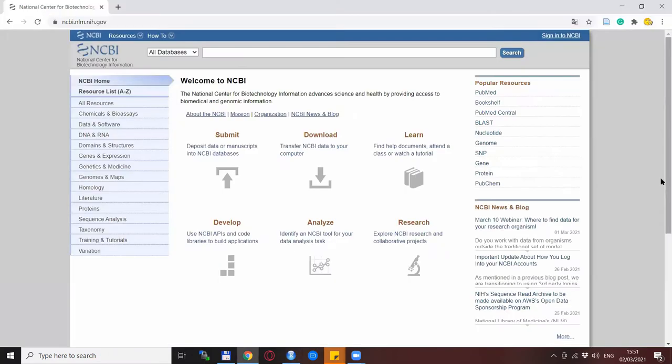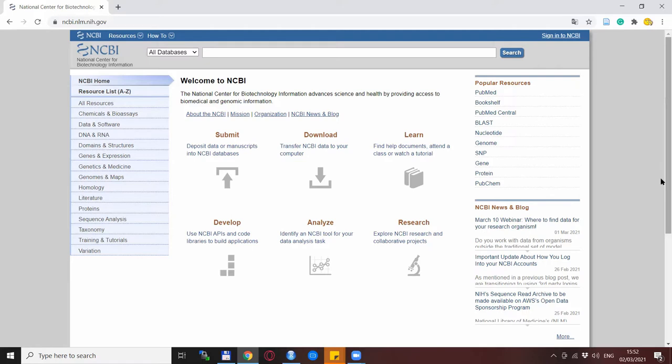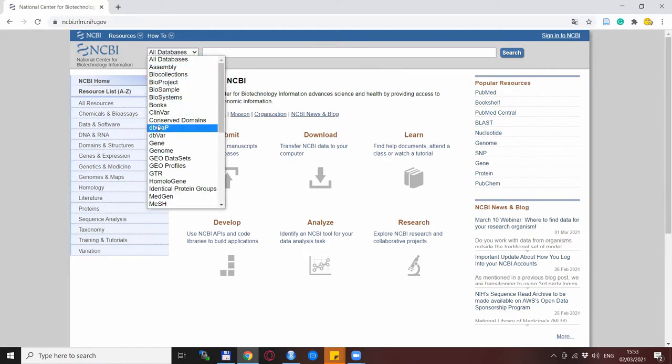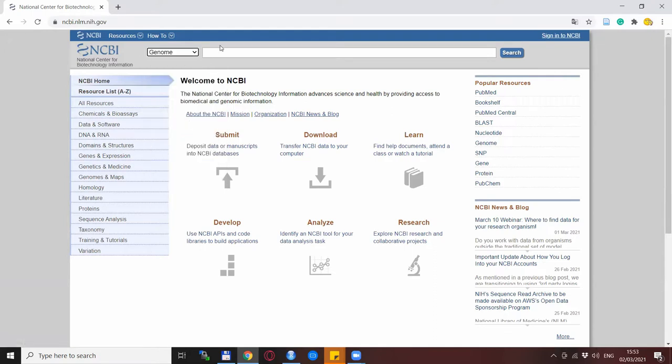The manual method involves some kind of a database and my favorite is the NCBI database where you can find a lot of things in this regard. Let's say that we have a region on the cattle genome that we are especially interested in and we want to see what genes reside in that region.